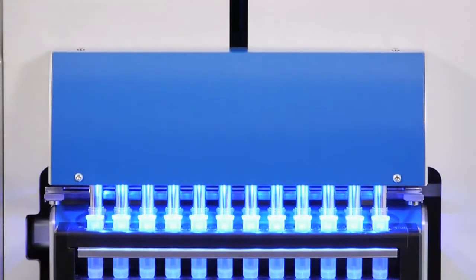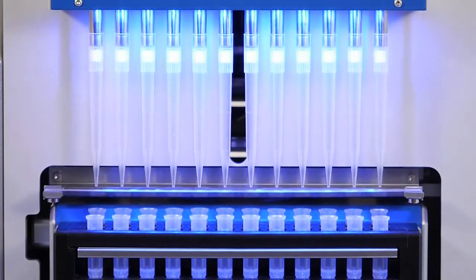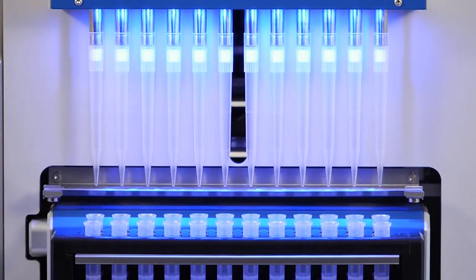At first, tips are taken out of the rack via the tip carrier. Now, the lysis buffer, which is contained in the Foodproof Magnetic Preparation Kit 1, is added to the tubes containing the samples by the tubing system.